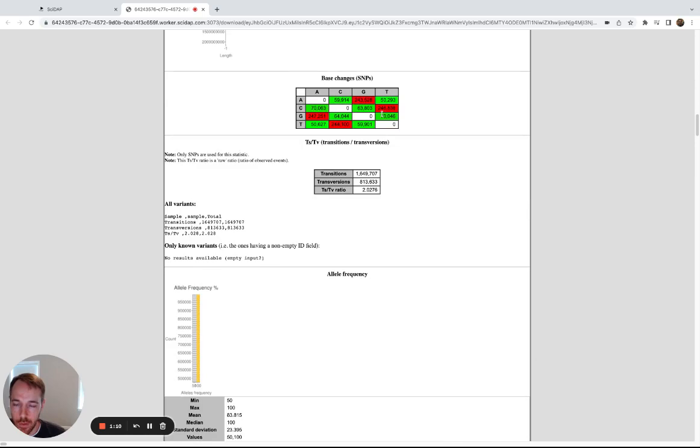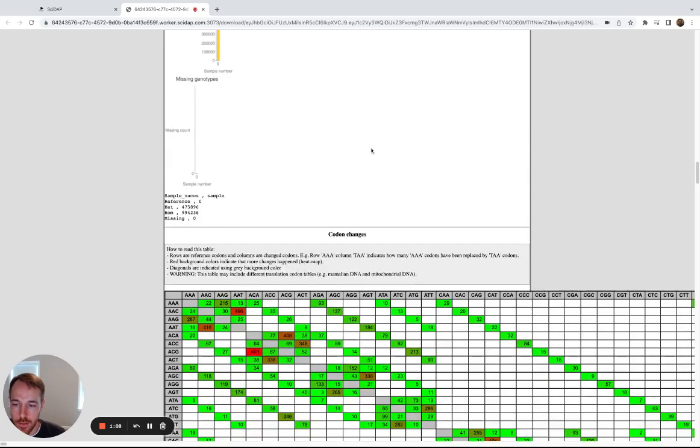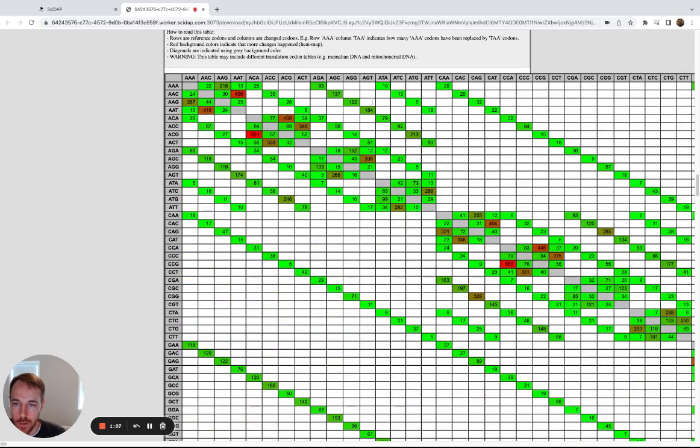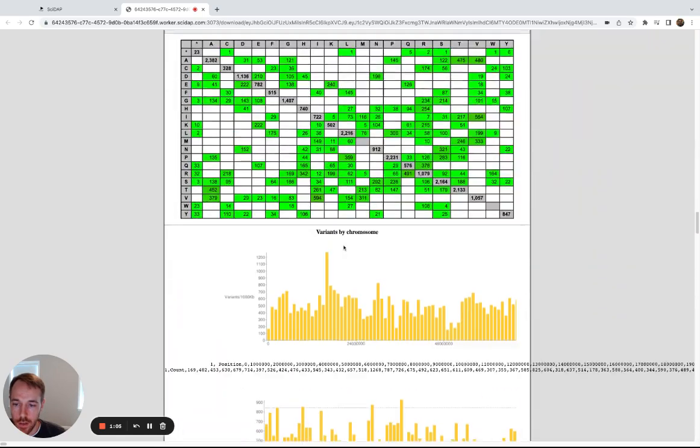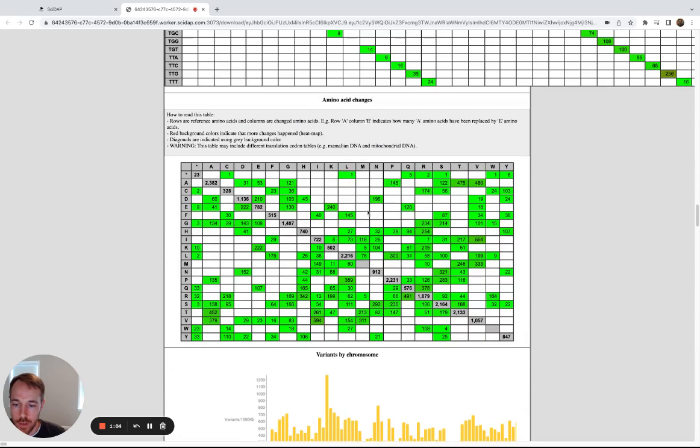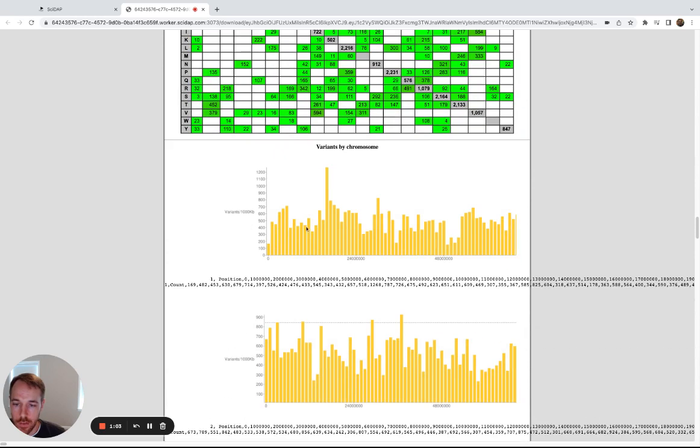Some confusion matrices for base changes, codon changes here, and amino acid changes, and then this histogram of variants along each chromosome.